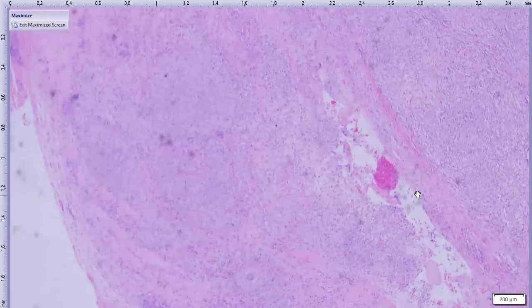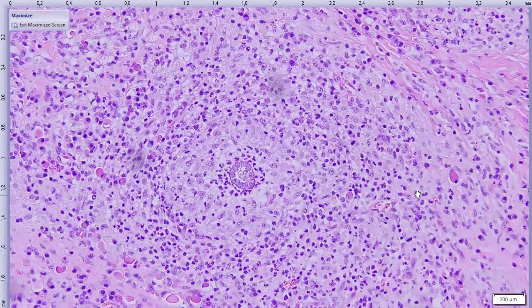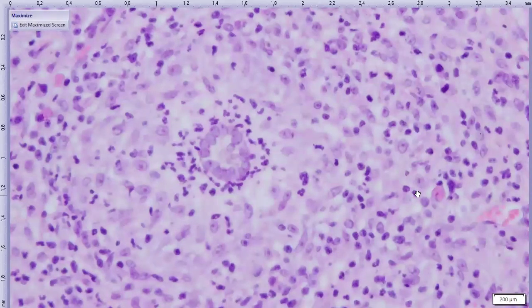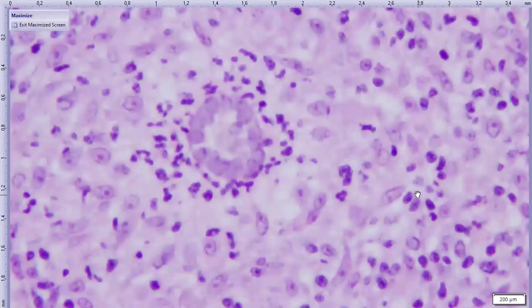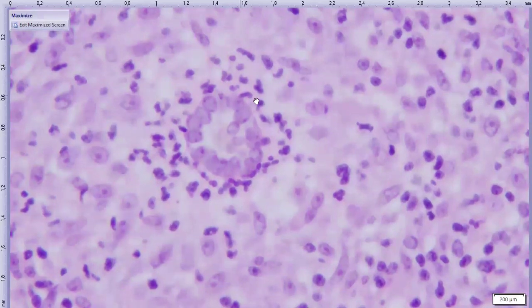I know there's a good one right down here somewhere. Oh wait, daughter sporangia, maybe. Straight up ruptured. No longer endospores at that stage because they're no longer bounded by a wall. I would say arguably these are still endospores then. Maybe somewhat indistinct, but there's a little bit of a wall around these. The neutrophils are excited to be involved in this.